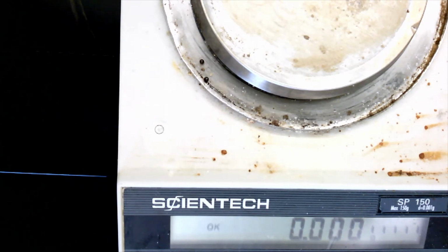Okay, so that's the end of procedure B. You should have gotten that last mass, 35.662, for the mass of crucible, lid, and magnesium oxide. And that's, of course, 35.662 grams. Okay, so we'll come back and we'll finish procedure A, and then we'll be done with the video.